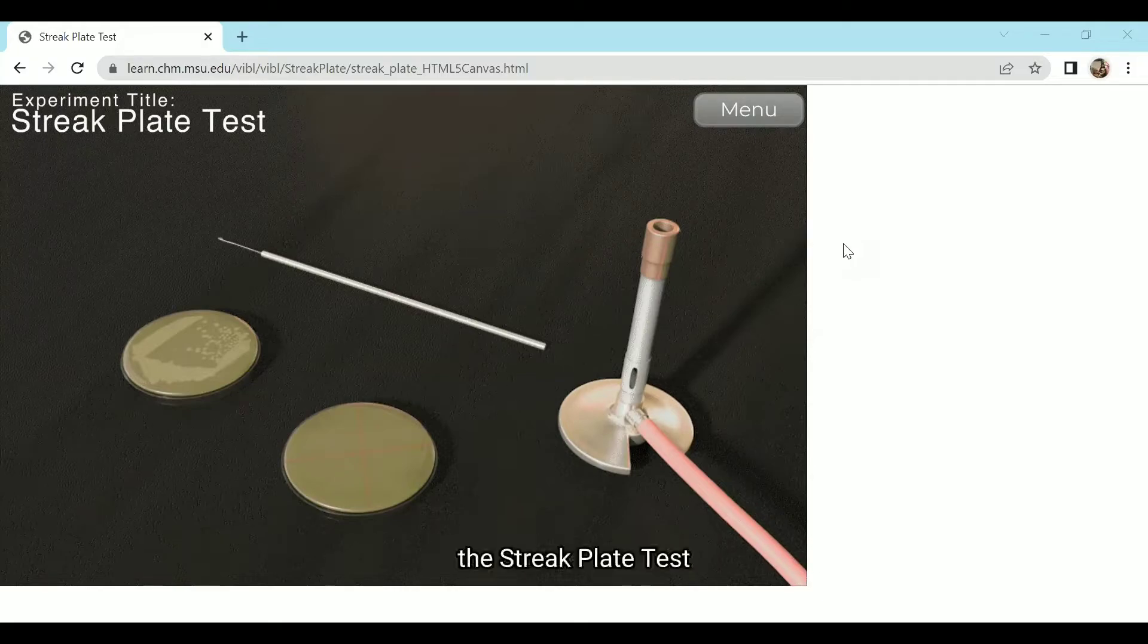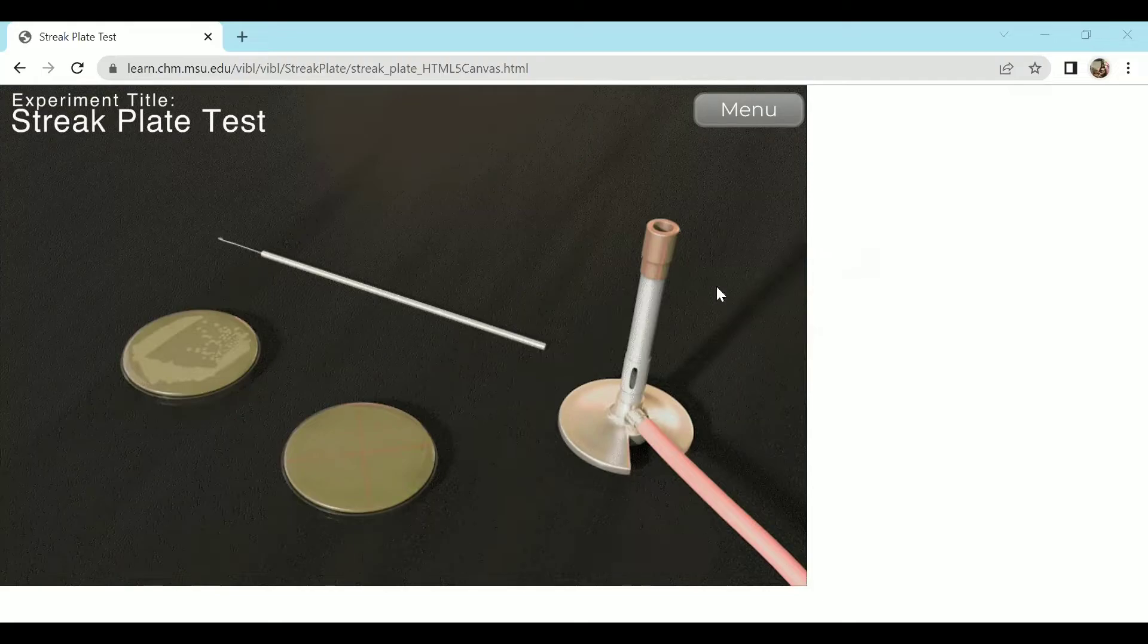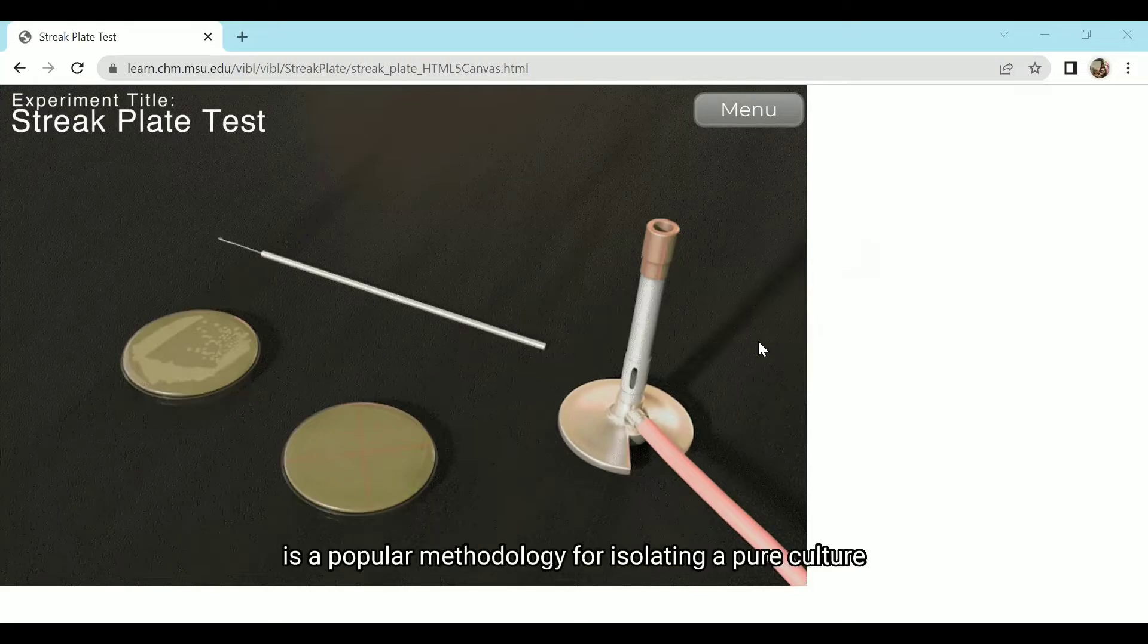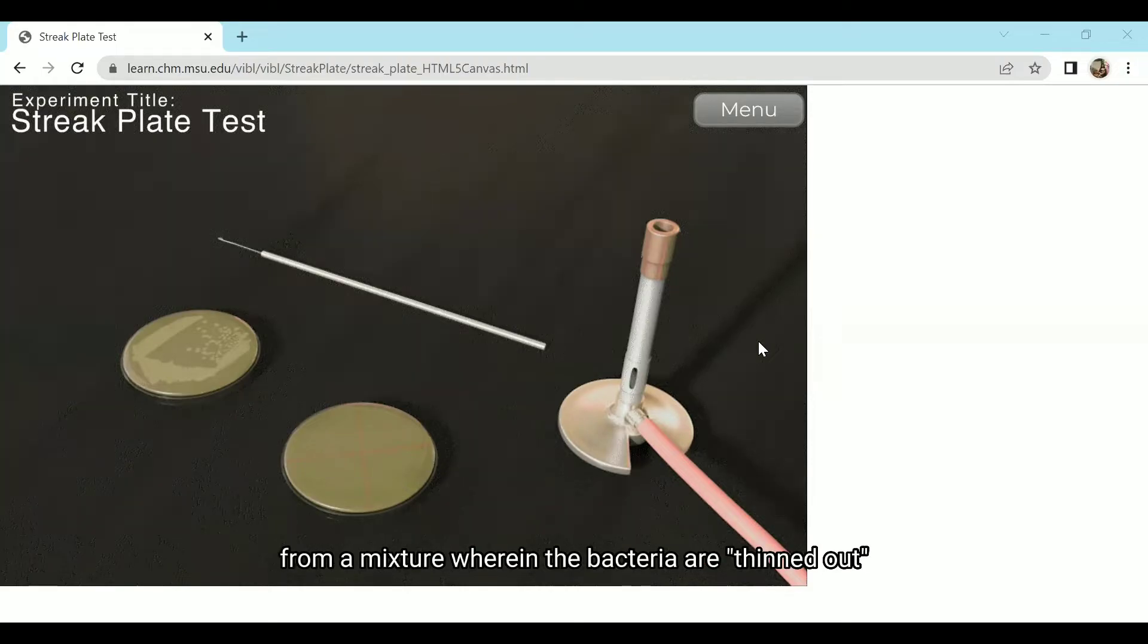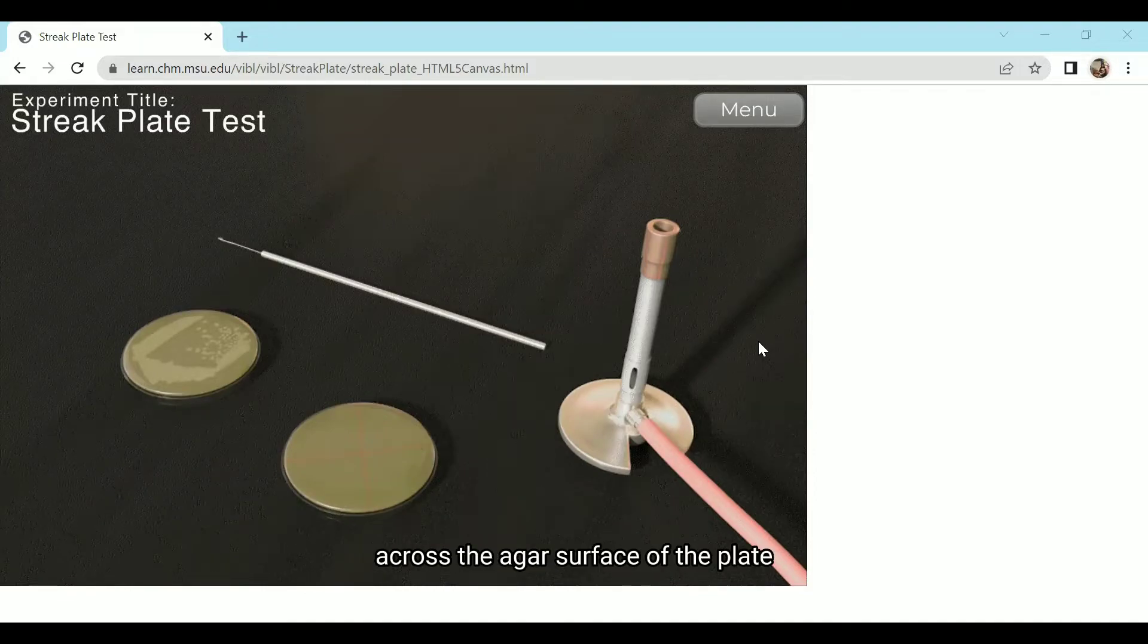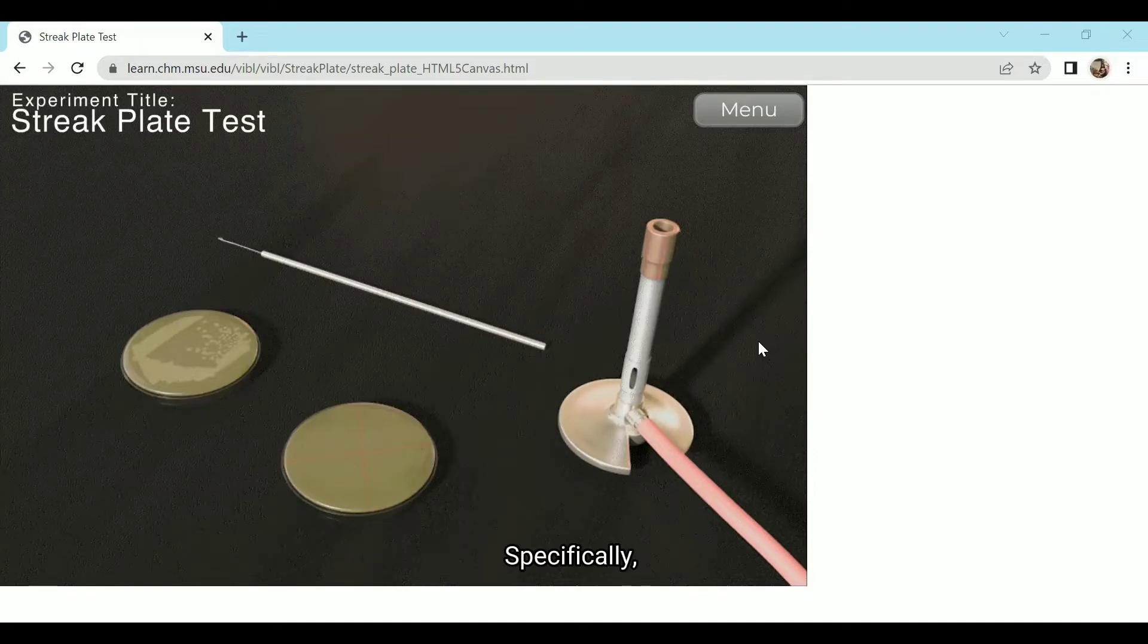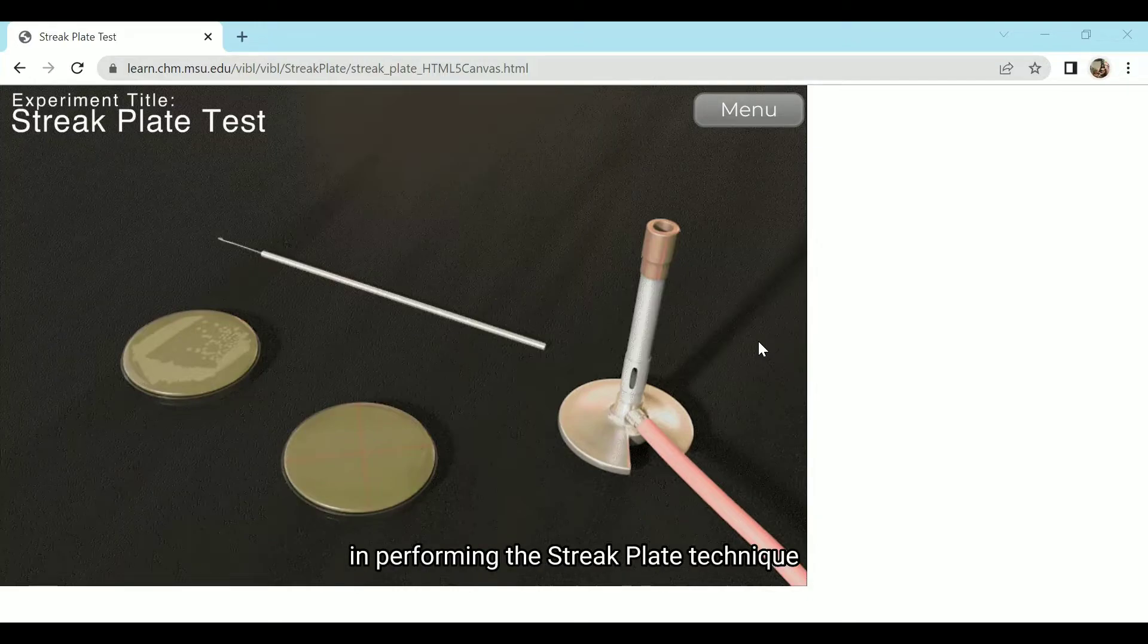The Streak Plate Test. The streak plate technique is a popular methodology for isolating a pure culture from a mixture wherein the bacteria are thinned out by streaking the inoculum across the agar surface of the plate. Specifically, I will be discussing the procedures in performing the streak plate technique.